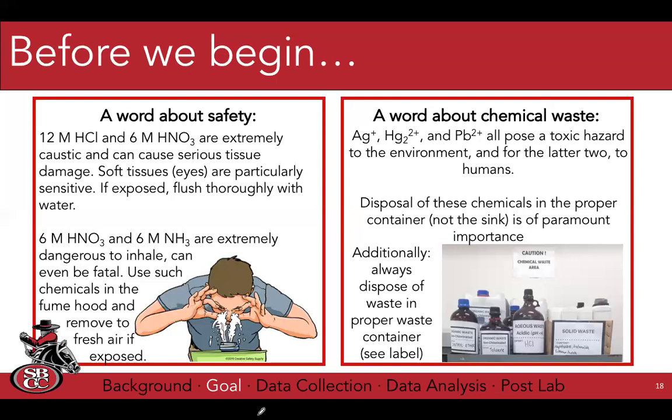And certainly for chemicals, organics, and oxidizers, those things definitely don't want to be mixed, because you can have inadvertent chemical reactions.